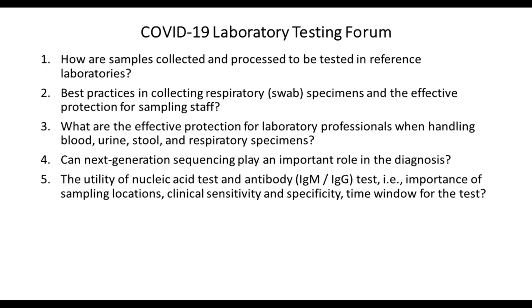And here I want to share some details that you may not learn from guidelines. During your work, the air you breathe out and the sweat of your face will make your glasses and mask fog up. It's not convenient and will be very dangerous if you cannot see clearly. So I advise you to prepare some anti-fog things like anti-fog gel to protect your glasses or mask from fogging up. And during your operation, in my experience, your gloves fall off from your wrists very easily. So we usually use some plastic tape to stick the gloves to the sleeves of the protection clothing, to prevent our gloves from falling off.